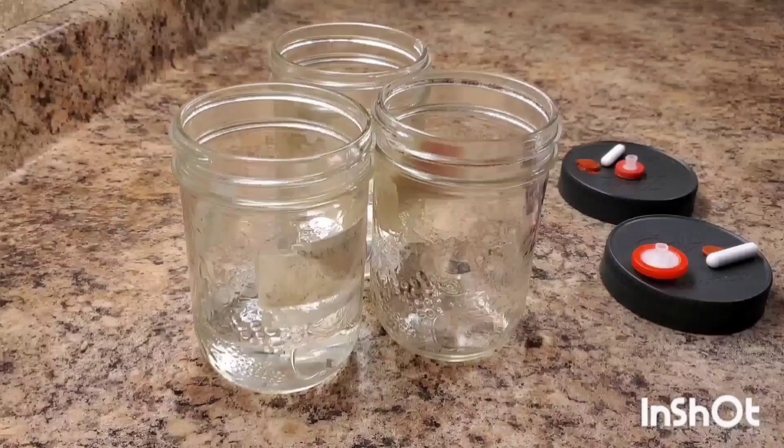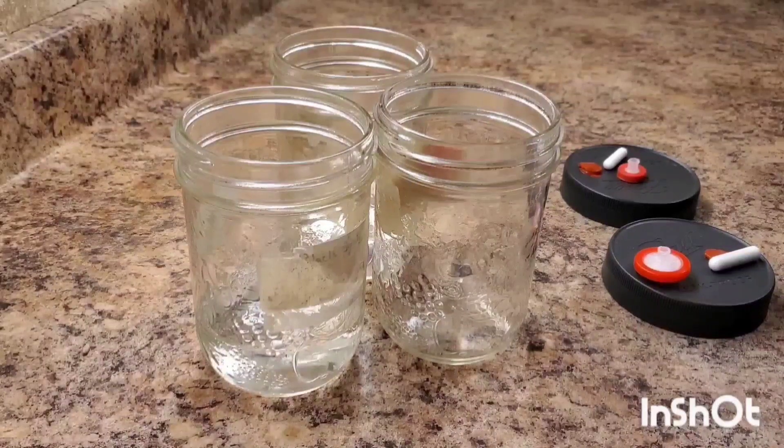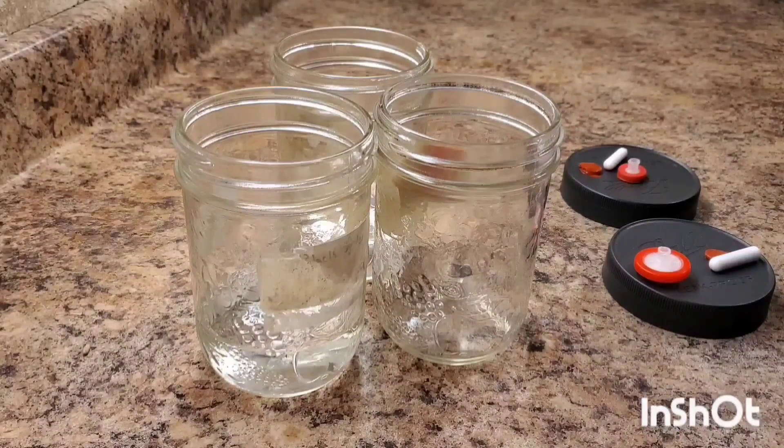Today I'm going to demonstrate how to make a liquid culture broth. This is for expanding liquid culture or bringing mycelium from agar into liquid form. It's a much simpler technique than you may think — you're pretty much just making a liquid broth that is sterile.